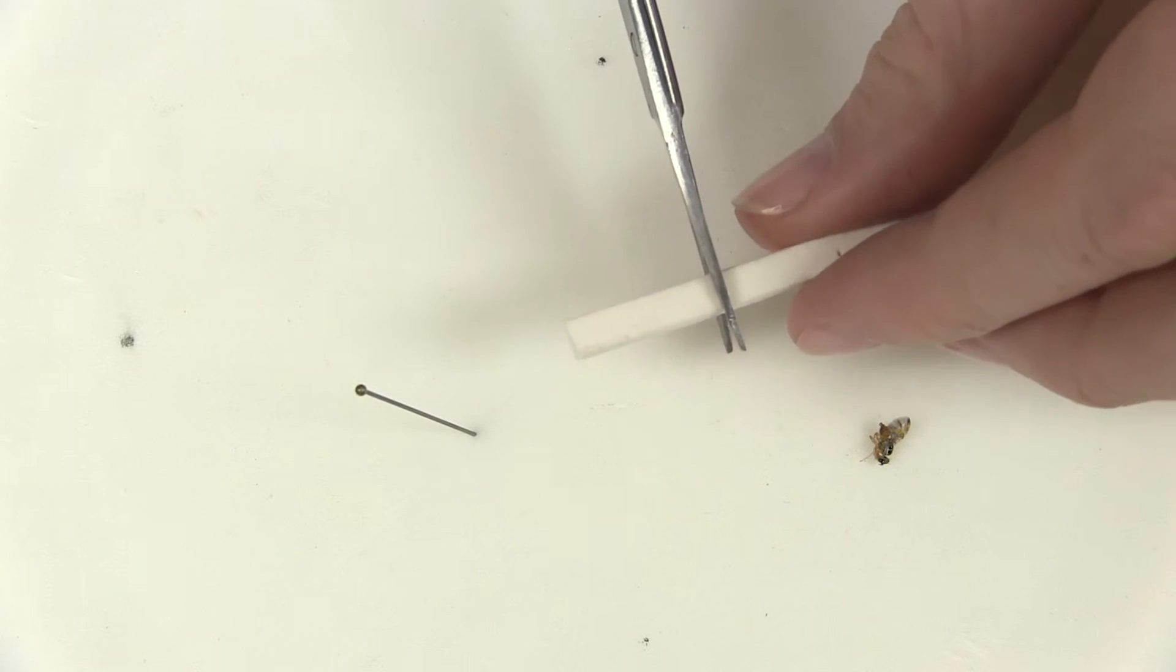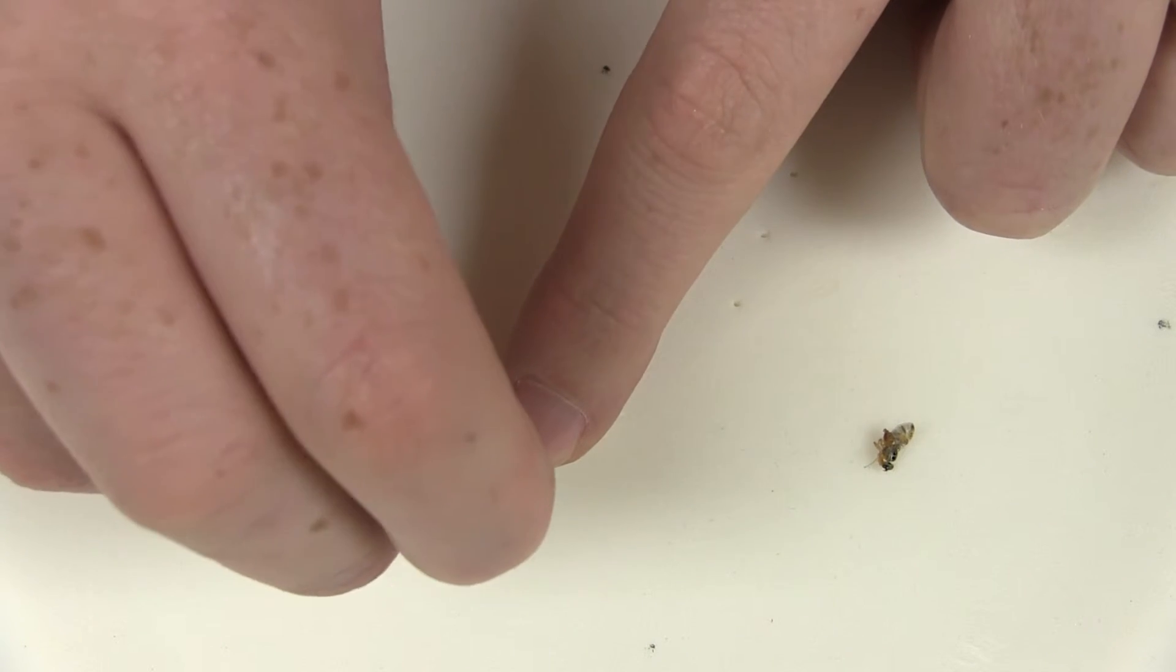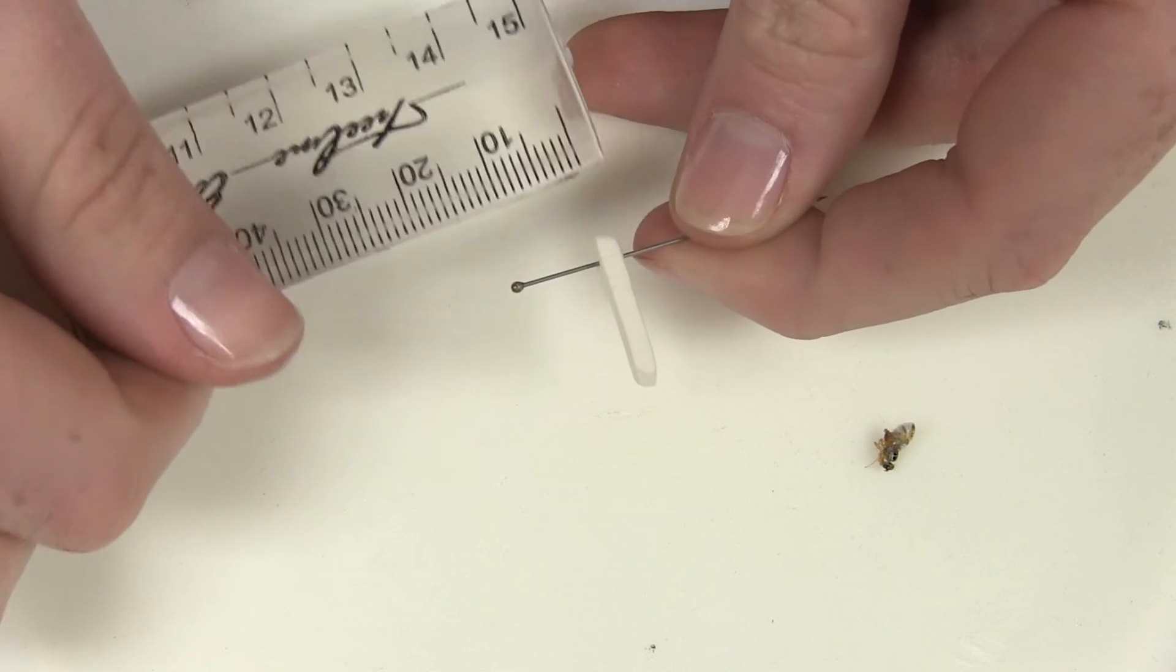Cut a piece of foam that is slightly longer than the length of the insect. Pin the piece of foam near the edge approximately one centimeter from the top of the pin.